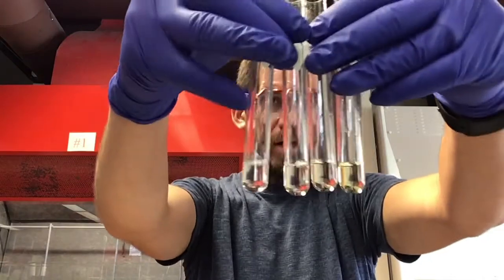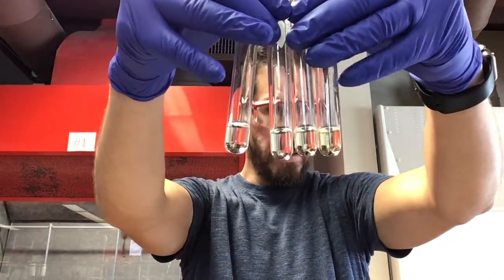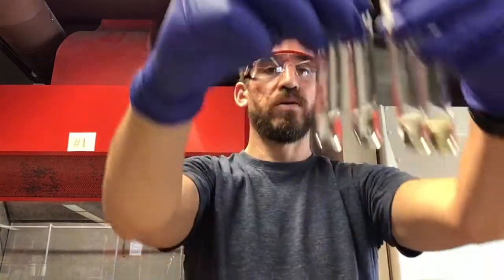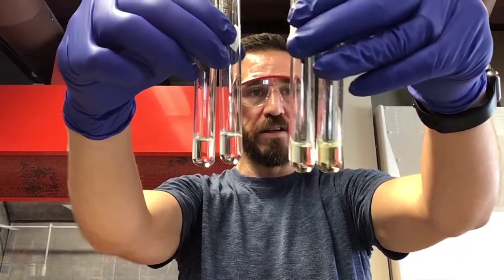Let's hold them all up together. This is 1 on this side, and this is 4 on this side. So you can kind of see the difference in color. Oddly enough, it looks like the first 2 reactions are colorless, and the second 2 are yellow. So again, just an observation.